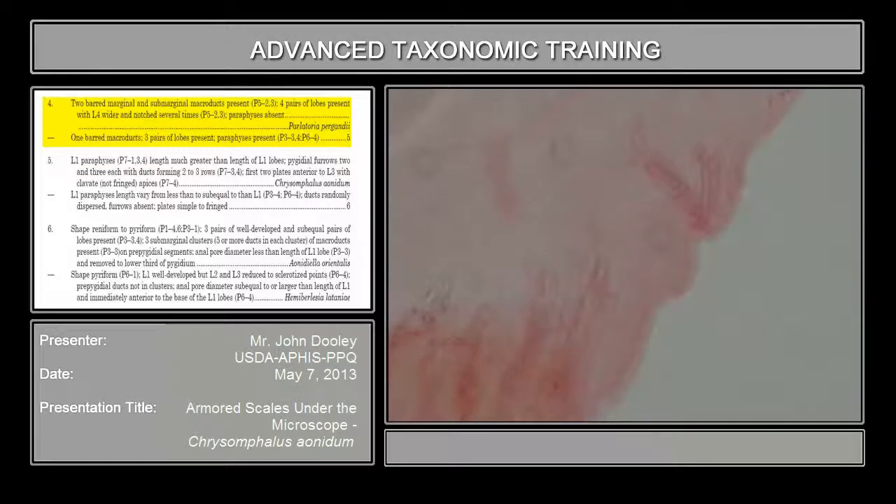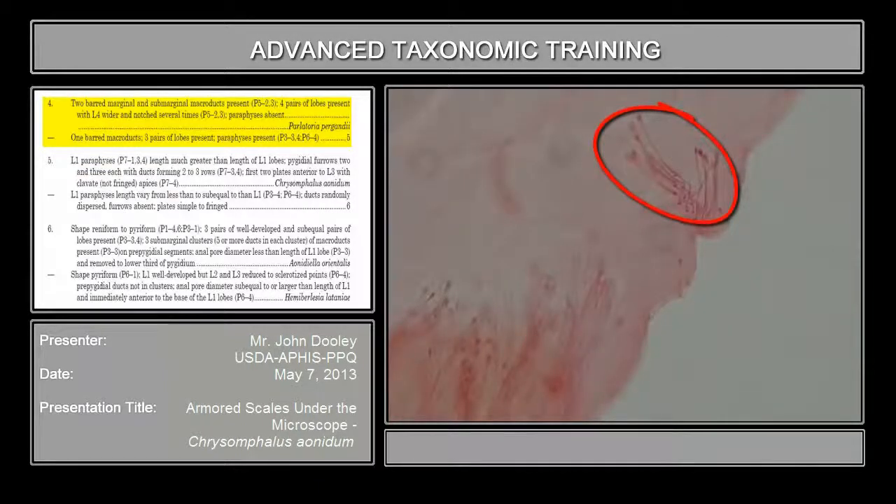I'll focus it in. This is indicative of this species — it has only one set of macroducts on this abdominal segment. If it has one on here and one on here, then there's a whole new species called bifasciculatus. But Chrysomphalus aonidum has just this one.